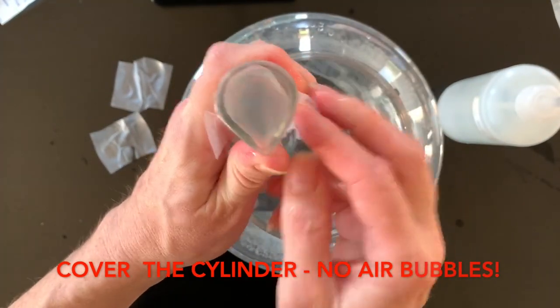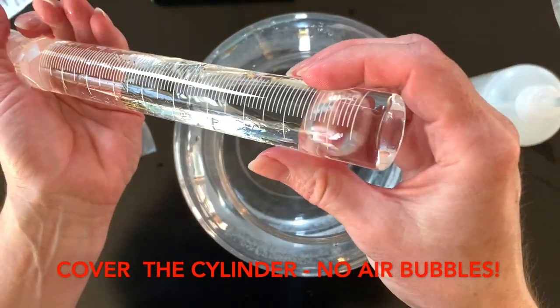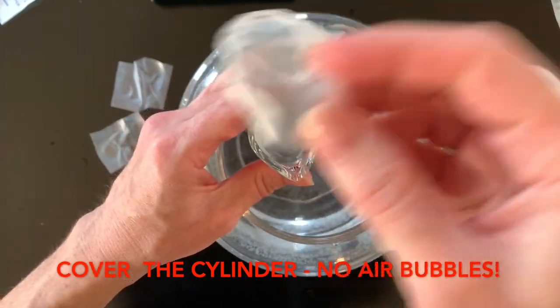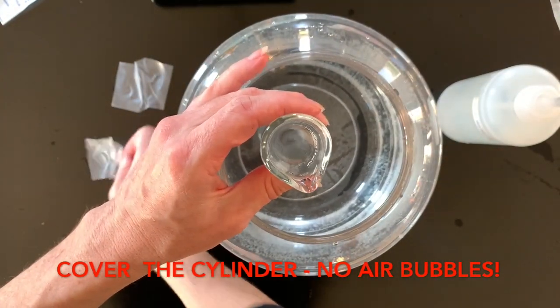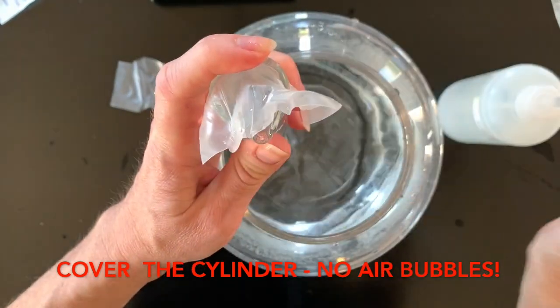We need to make sure that we are collecting only the gas from the lighter over water and not any air bubbles. So before you start this experiment, you must make sure you have no air bubbles in your graduated cylinder because they will cause errors in this lab.